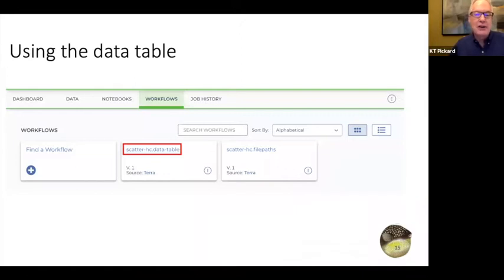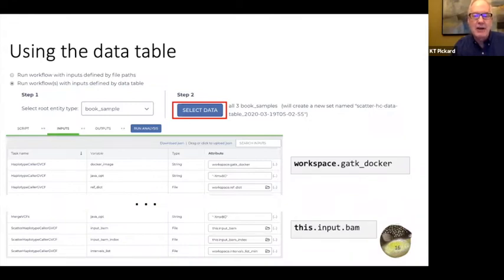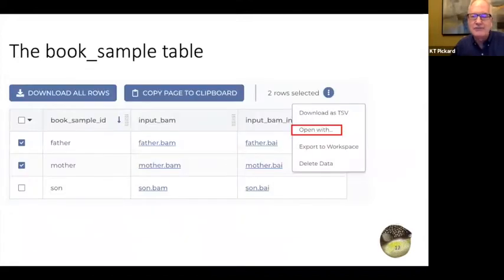Next, we'll go through a variation of this, looking at the ability to pick out specific files. And this is where we'll pick out, in a trio, a couple of different things. Introduce the concept of workspace. These are some generalizations that are kind of object-oriented that allow you to refer to a workflow in an abstract way, enabling you to make a change in a WDL file that then would refer to other workflows without having to go in and manually edit and change everything. So in this case, the Docker image could refer to a different Docker image across the board, and you wouldn't have to individually change individual files.